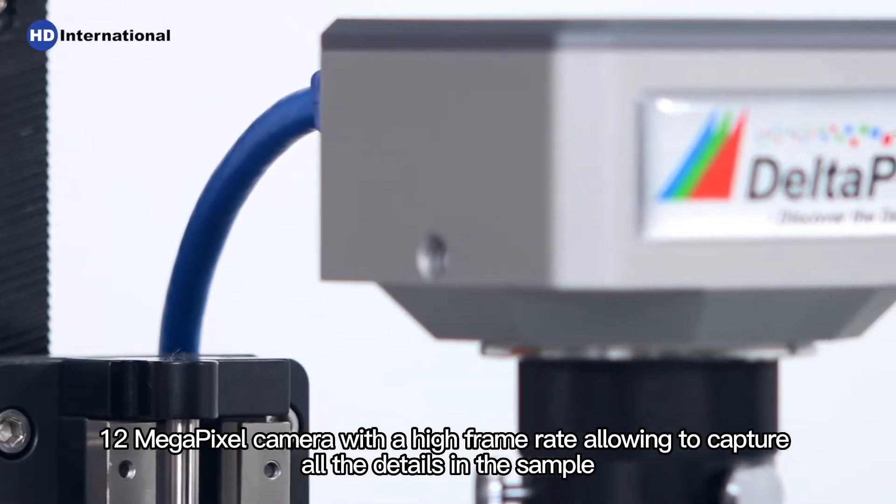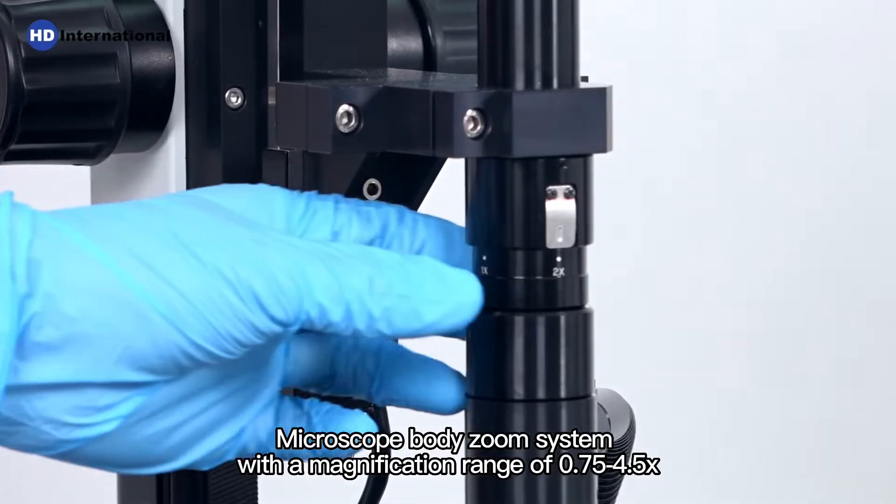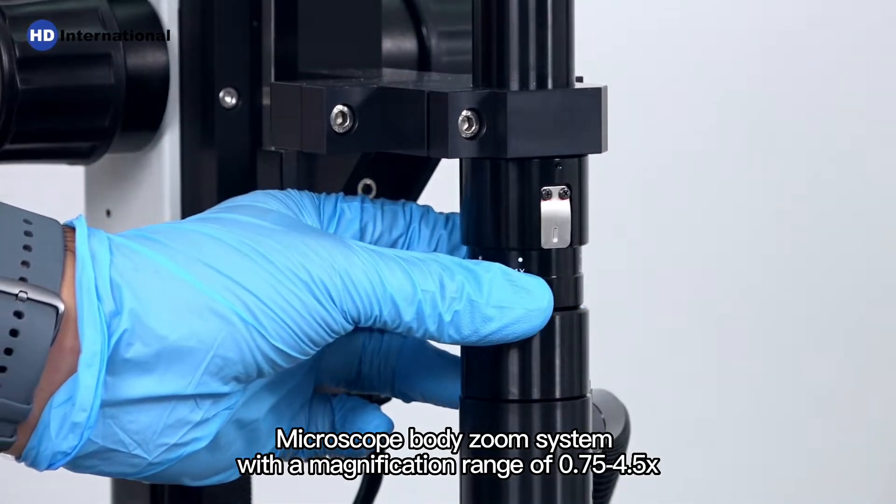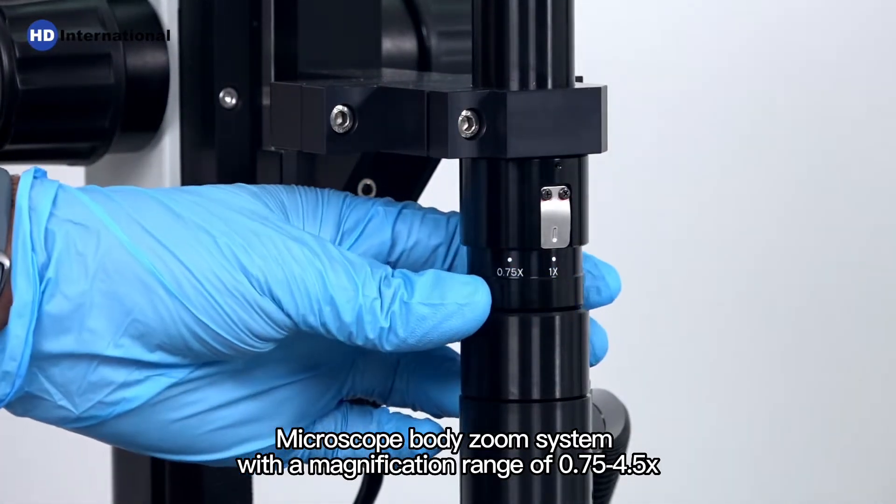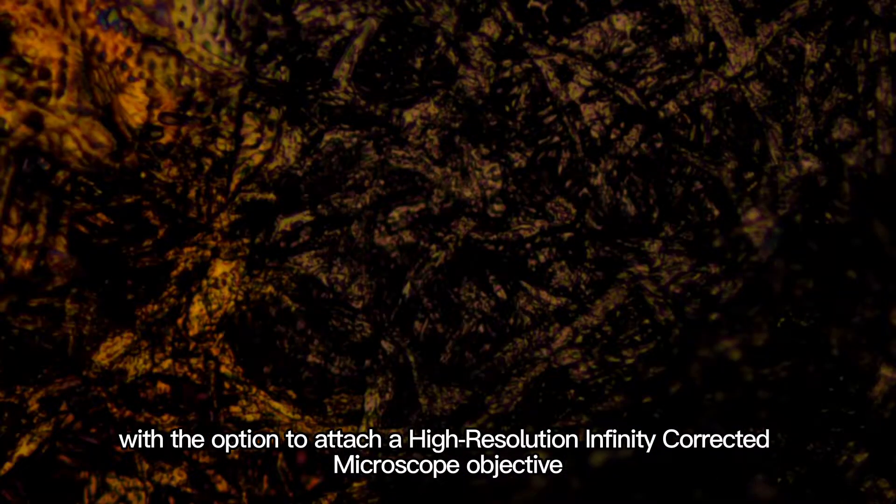The camera has a high frame rate allowing capture of all details in the sample. The microscope body zoom system provides a magnification range of 0.75 up to 4.5 times with the option to attach a high-resolution infinity corrected microscope objective.